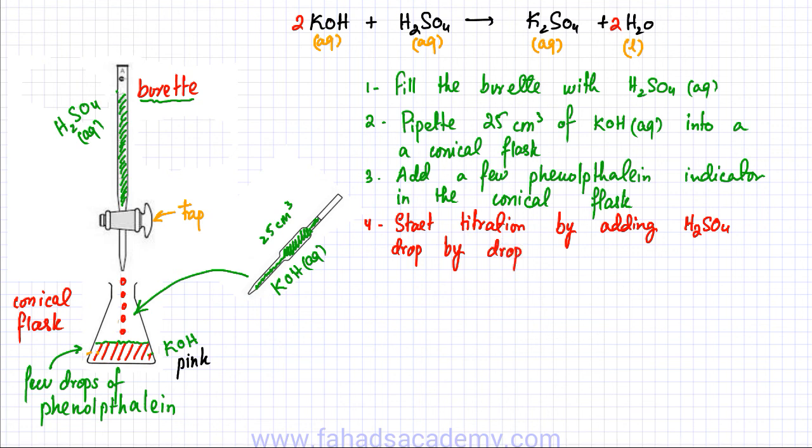Now, when you are adding H2SO4 into KOH, what's going to happen is that the solution in the flask will slowly convert into K2SO4, because KOH is going to react with the H2SO4 coming from the top. So slowly your solution would be turning into K2SO4 aqueous.